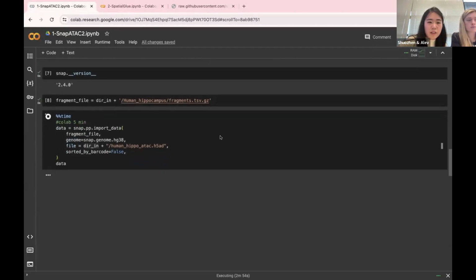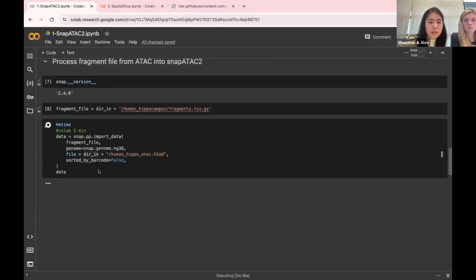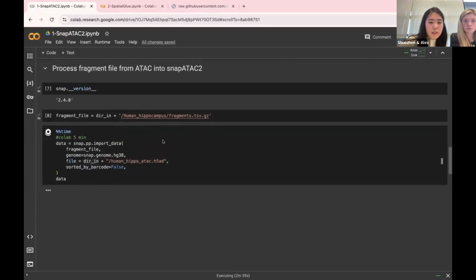My code is still running, so if the audience has run through this part, you can put a thumbs up in the chat.